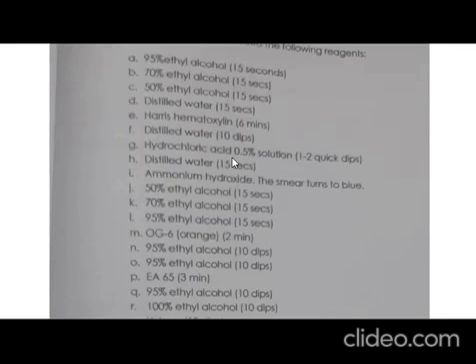So you proceed to diluted hydrochloric acid. The purpose of your diluted hydrochloric acid is to remove the excess hematoxylin. That is still the purpose, the same as the function of distilled water. So the excess hematoxylin stain that was not removed by distilled water will be removed by the diluted hydrochloric acid. And then, distilled water again, to rinse the smear from the hydrochloric acid.